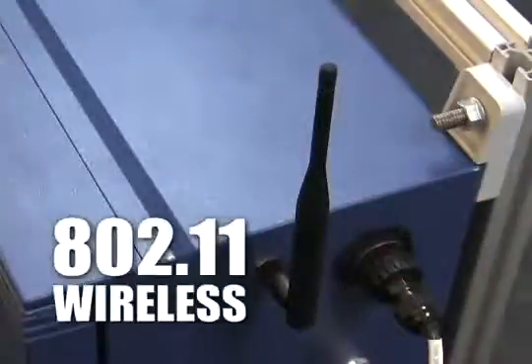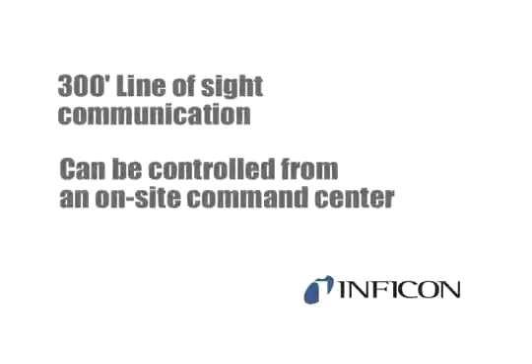The CMS5000 has 802.11 wireless with a maximum of 300 feet line-of-sight communication and can be controlled from an on-site command center.